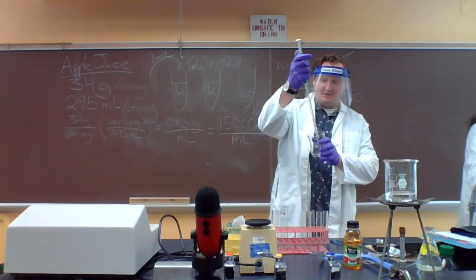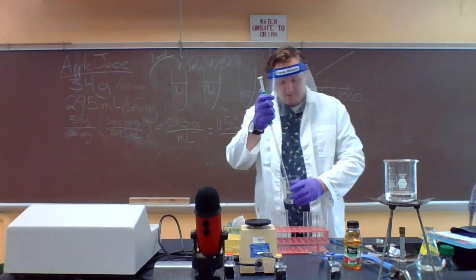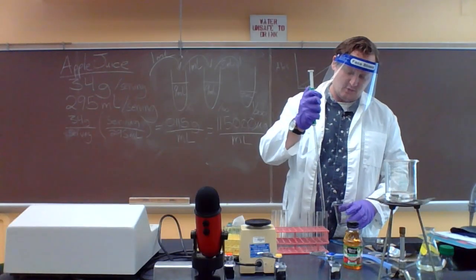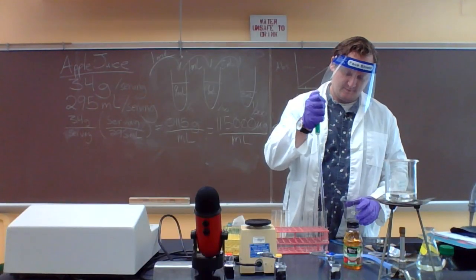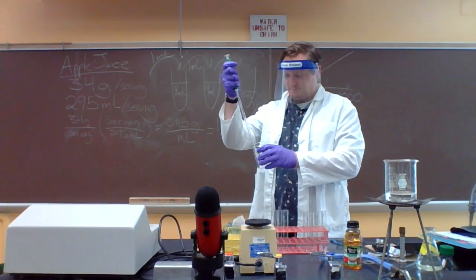Thank you so much. Alrighty, so I know the volumes that I need. I'm gonna add 9 milliliters of water to tube 1. Perfect. 9 milliliters of water to tube 2.